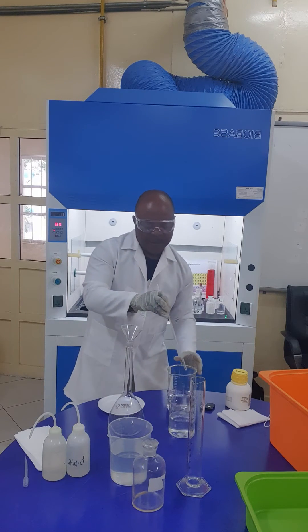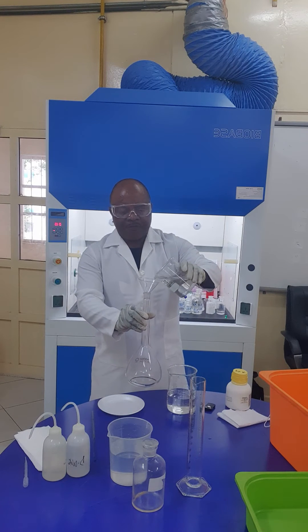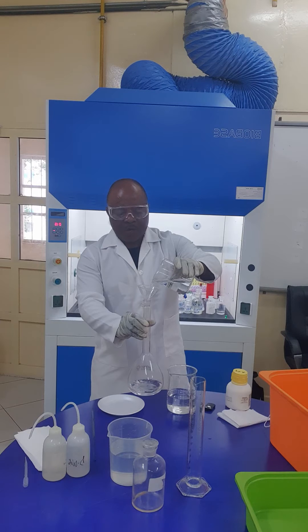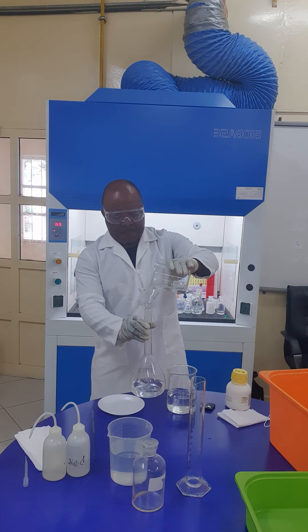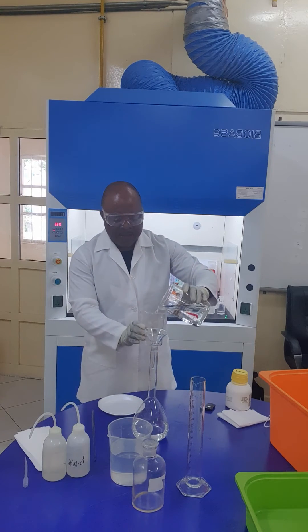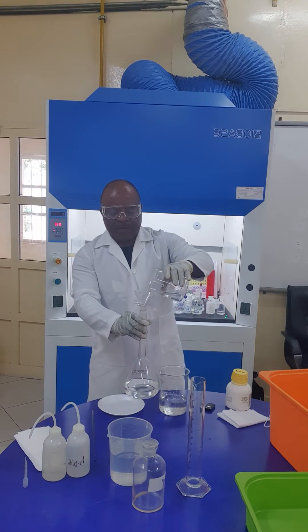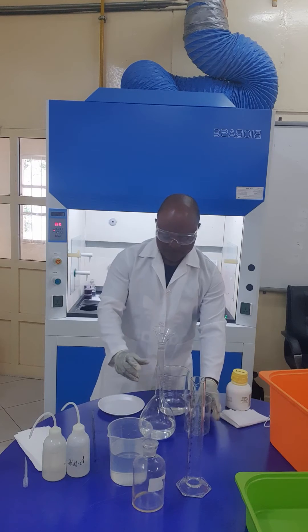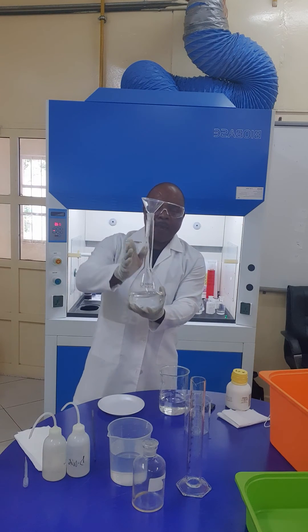Now we have to put it into the volumetric flask. Make sure the sodium hydroxide gets into the volumetric flask. Now we put the dissolved sodium hydroxide into the volumetric flask with a lot of caution because it is also corrosive. Every bit of it — we have to rinse the beaker to ensure that all the sodium hydroxide gets into the flask.